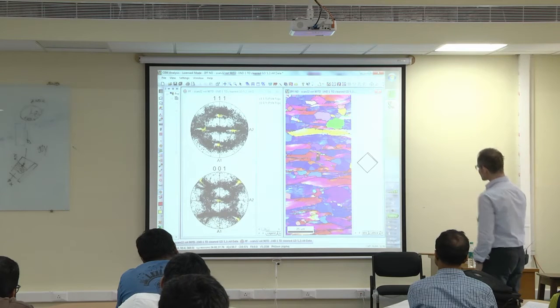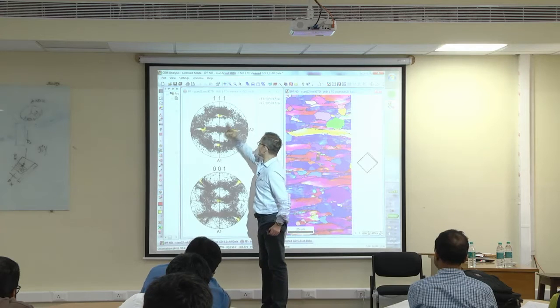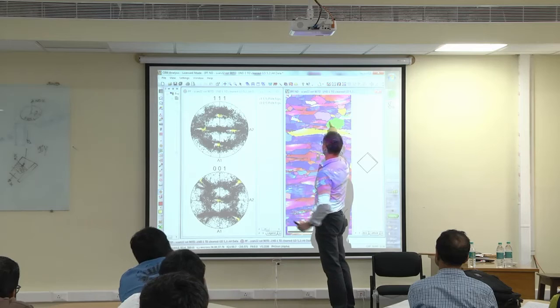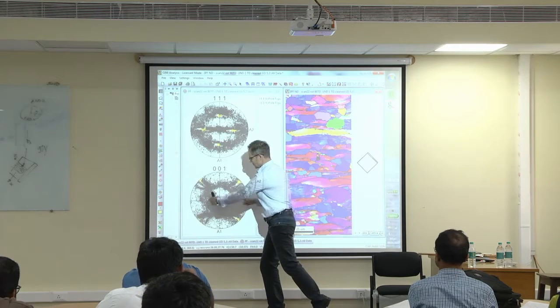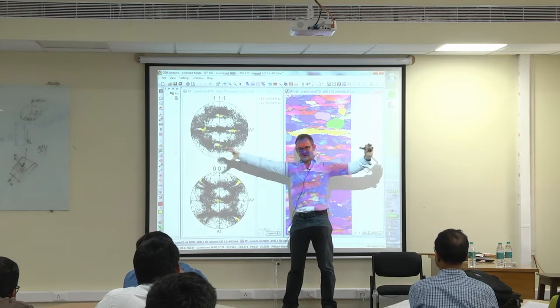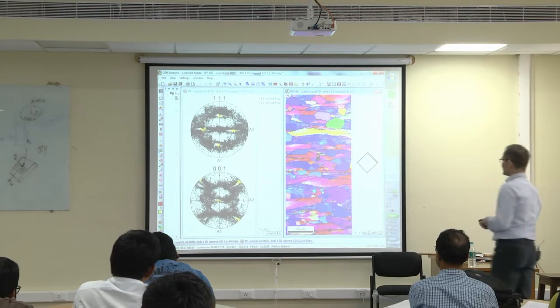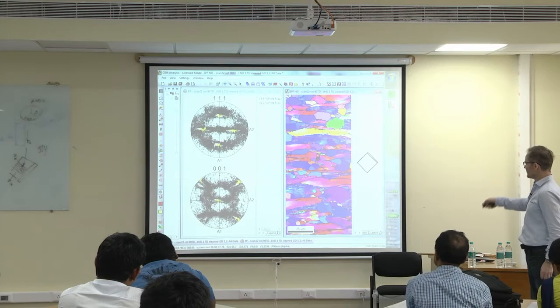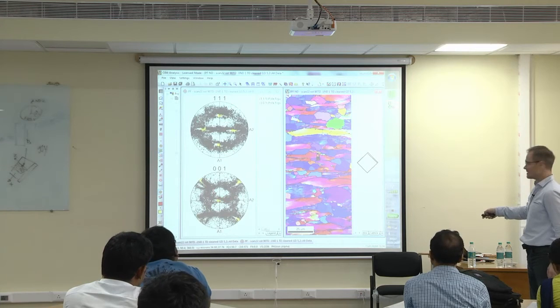All right. And what you also see, the green was just one single point, or a few points only, because this is a recrystallized grain, and the yellow is a deformed grain, and that's why it has quite a spread of orientations. That's why we are seeing it better. It's more orientations covering in space. And that shows already, obviously recrystallized has always a peak here, and recovered has always, and deformed has almost always a peak here.